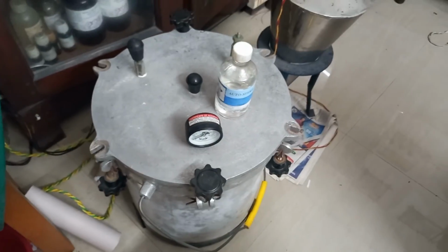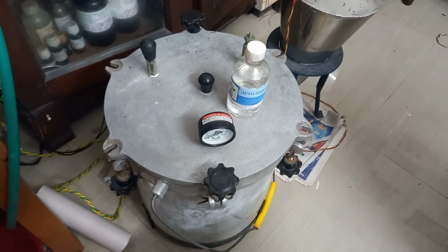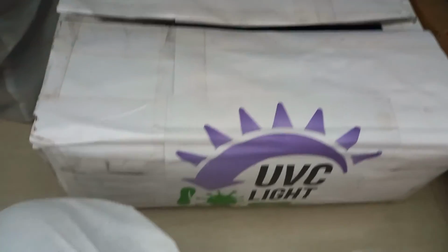So now we are going to move our attention towards the UV chamber. That will be our next part of the video. So be with us.